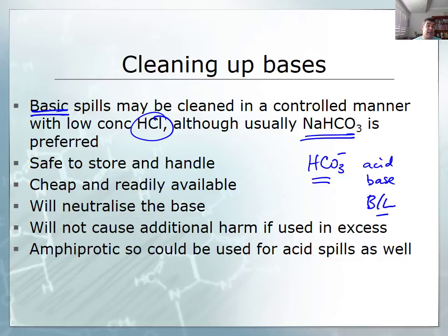It's again very safe for storage and handling. It's very stable. Again, it's not going to be a problem if it's used in excess, as we talked about previously, and it has the advantage of neutralizing both low concentration or weak acids as well as basic solutions. This amphiprotic nature of the bicarbonate ion makes it an ideal one to choose for acid or basic spills, even though for the strong acids we tend to still use, as I mentioned before, the sodium carbonate ion.